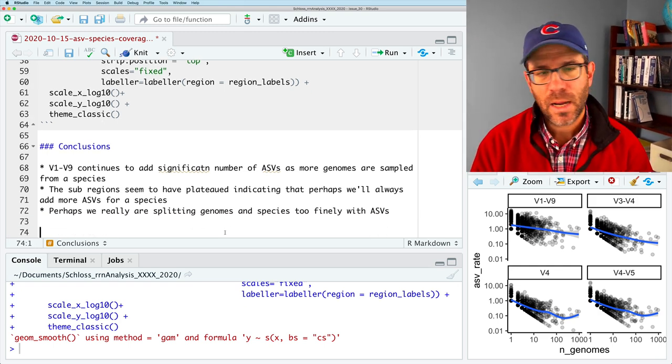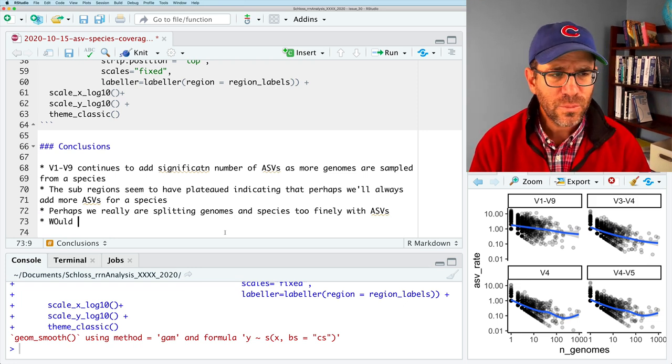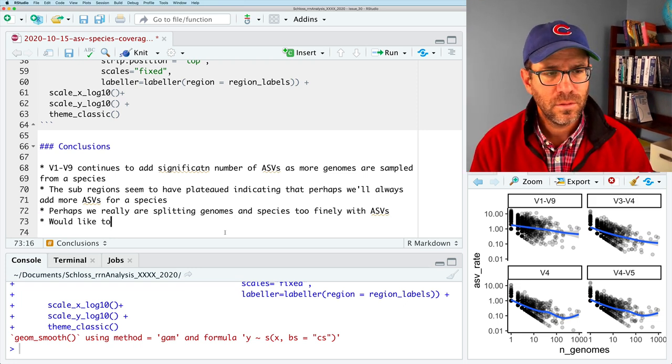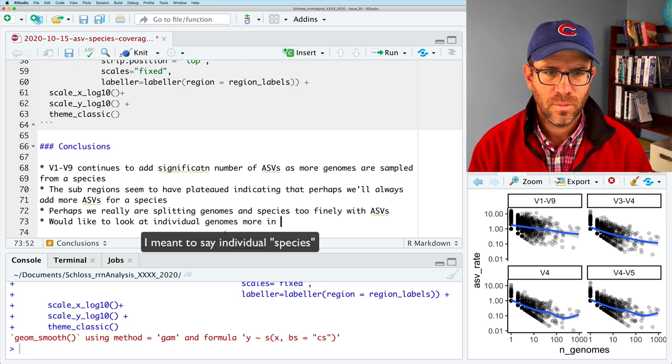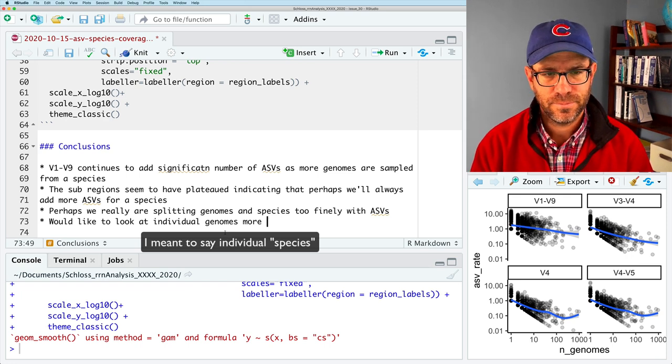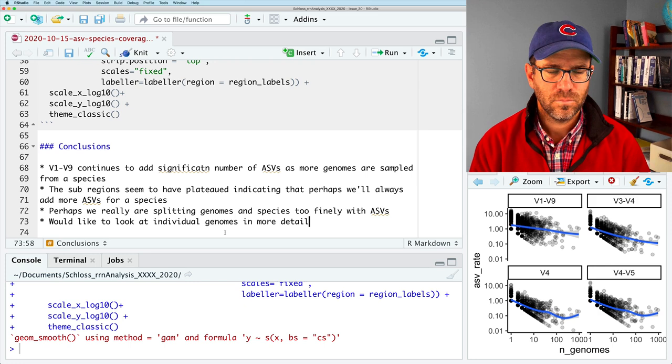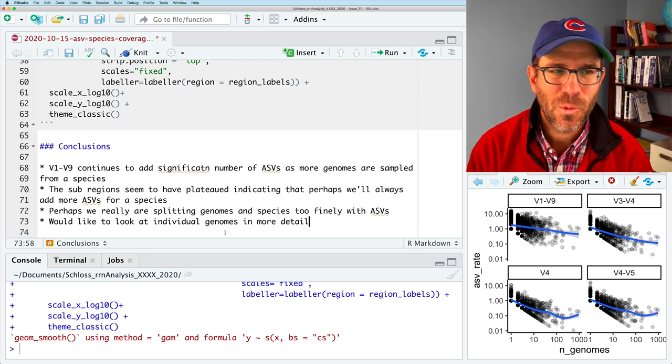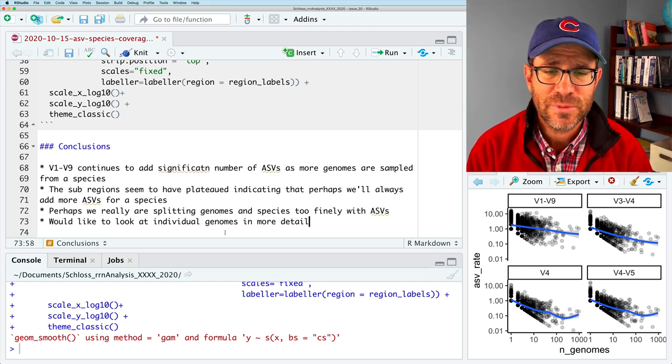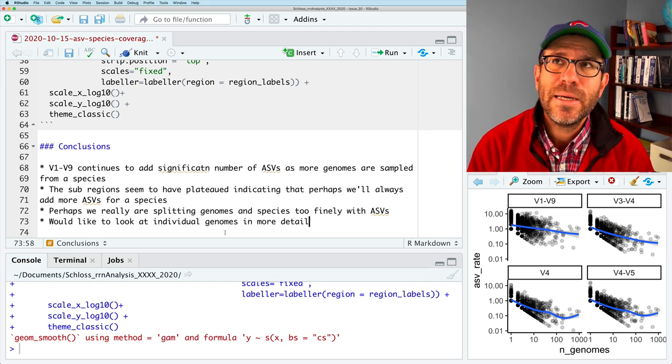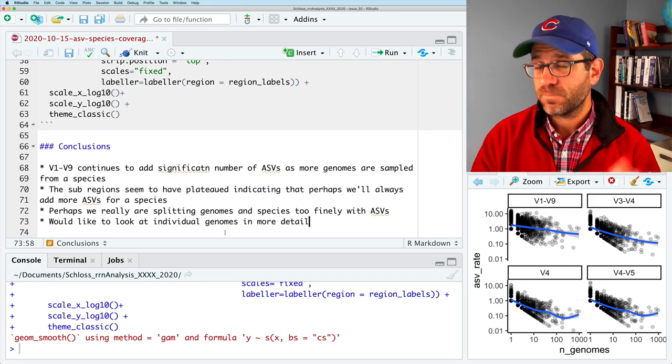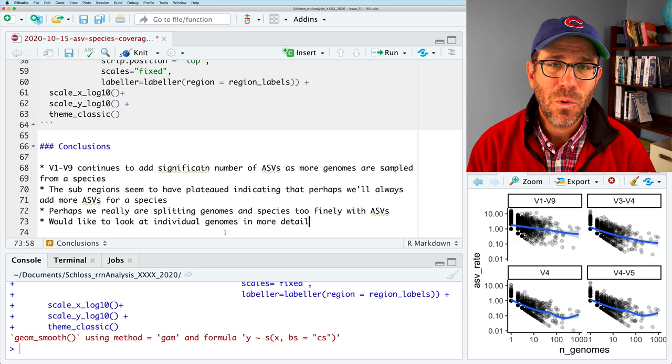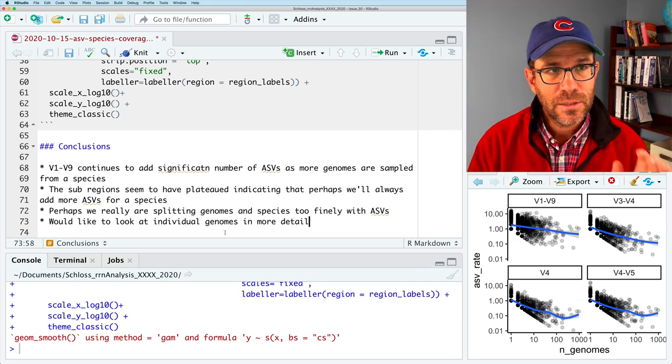And what I would like to know is I would like to look at individual genomes in more detail. And so that's what we're going to do in the next episode. We're going to look at this in more detail, looking at individual genomes to say, what are the number of ASVs across these four different regions for different species? And so to do that, we'll save that for the next episode where we'll learn some new tricks.